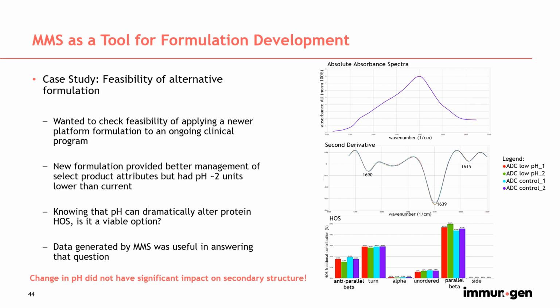Although in this case just one formulation condition was looked at for screening, considering that MMS does have an automated workflow capacity, we could see how this could be easily used for early-on formulation development and screening studies, where there are a large number of screening candidates and conditions that formulation scientists need to look at for effective formulation development.